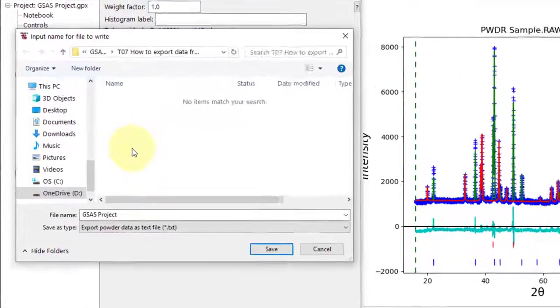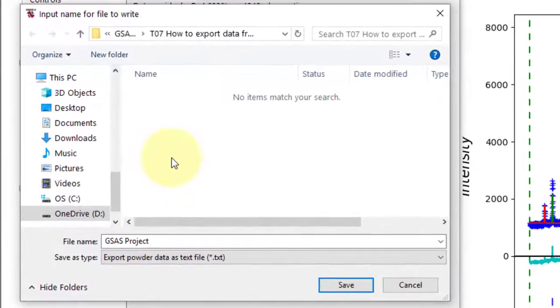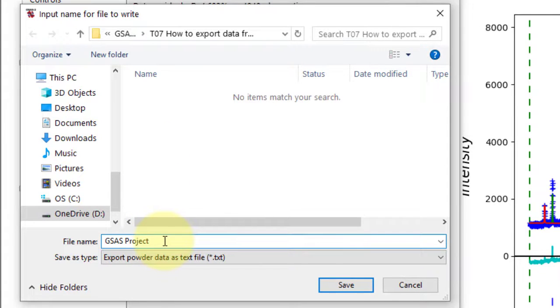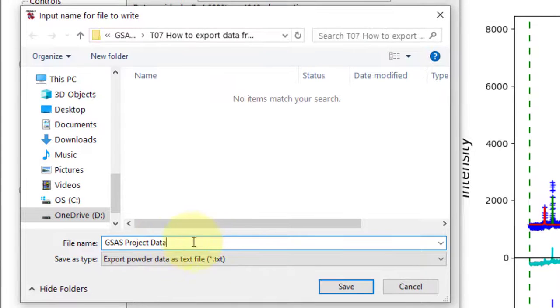You will be prompted to name the file. Change the default name as we will be exporting another file later that will automatically be saved with the project name without the option to change it.